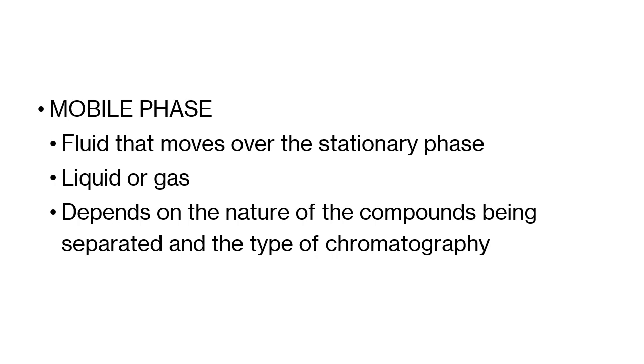As I said earlier, you have a lot of types of chromatography. You have thin layer, adsorption, elution chromatography, and a lot more. But for us, what we use in the laboratory is, again, the mobile phase, your butanol ethanoic acid mixture.